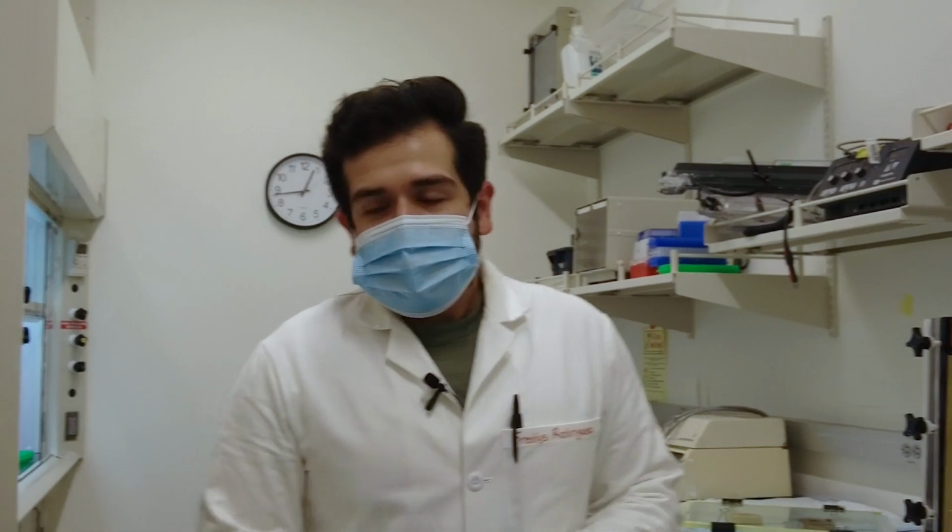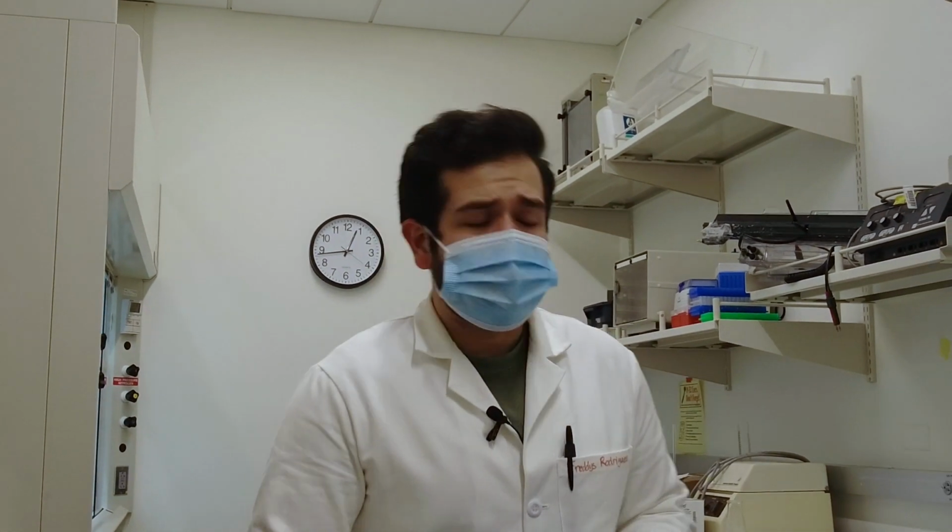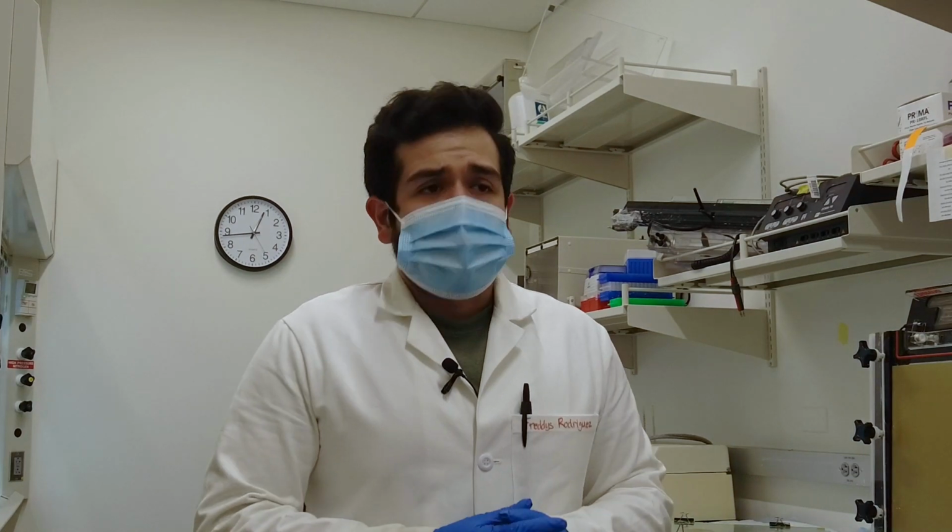The other thing you should do is put away the reagents that were used to make the gel and prepare the gel apparatus. Things like the Sigmacote reagent, you should put back at least in a 4-degree fridge, as well as the TEMED and ammonium persulfate. Those should always stay cold, so also put them in a 4-degree fridge.